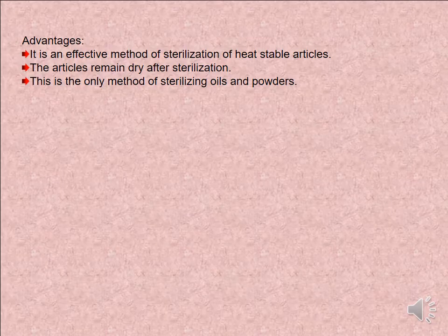The advantages of the hot air oven. First, it is an effective method of sterilization of heat-stable articles. Second, the articles remain dry after sterilization. Third, this is the only method of sterilization for oil and powder.